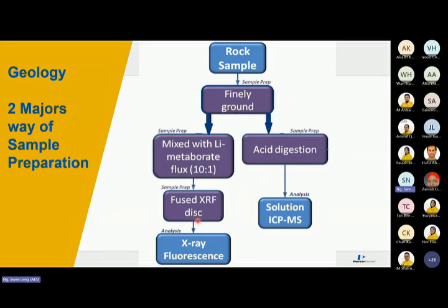In fact, from the fusion bead, you also can go to the ICP-MS. That will be a laser ICP-MS. Like in JMG, they have two units, and they already make the fusion glass bead. Because XRF can only run percentage levels, but from the previous slide you already have some concept, ICP-MS is low level. So that's why the same fusion bead they make for the XRF, they also use to introduce to ICP-MS.